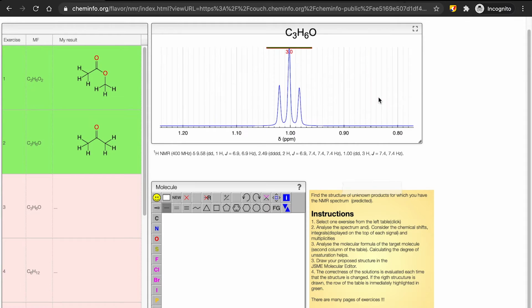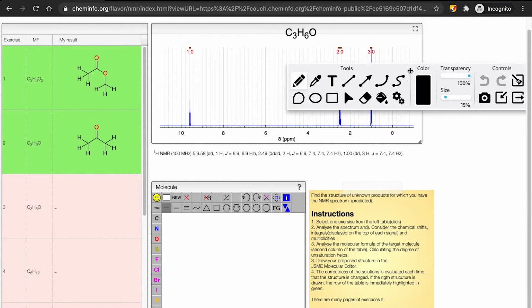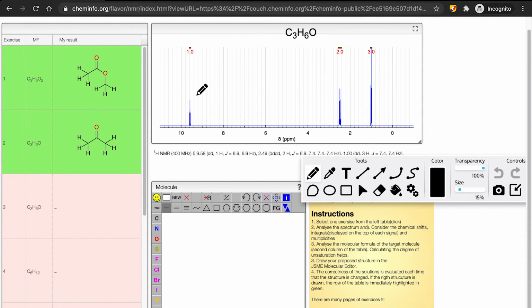And then here at about 1 ppm, this is a triplet. Okay, so those are our 3 signals. So we should label them to make sure we know what they are. So this one here is a triplet. Okay, this one here is a pentet or quintet, like pentet for 5, pentagon. And then this one here is a triplet. Okay, so triplet.